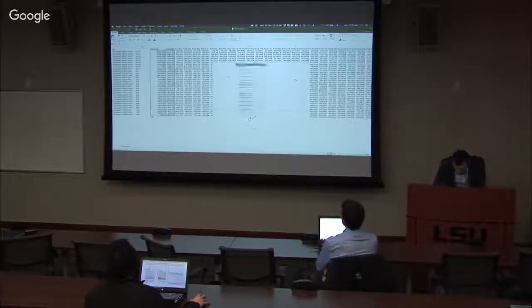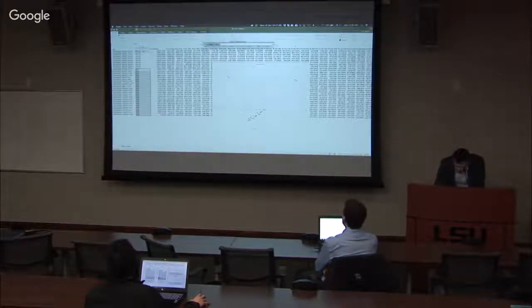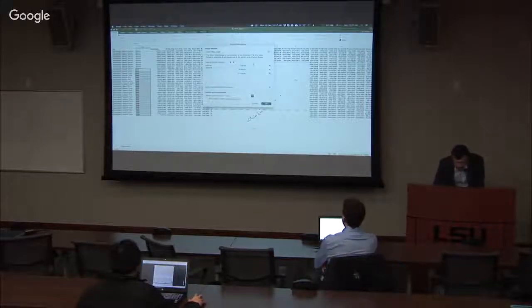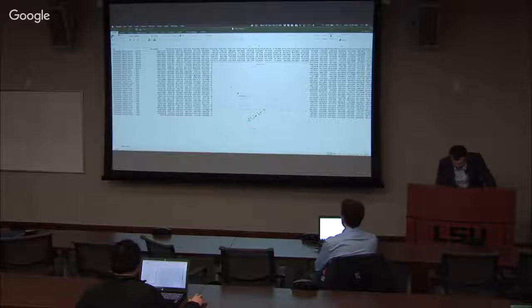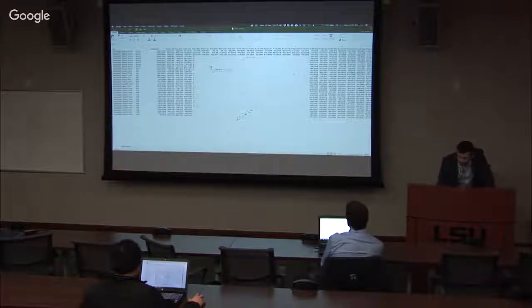Now if I use that information in my chart, these would be the normal ones. So I would take just the X for the normal and the Y for the normal, and then do the same thing for DCIS. And let's see what happens. What happens is that actually I have a split in my DCIS.